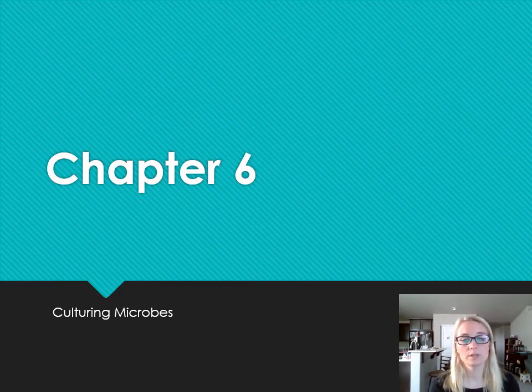And then you typically put it on some kind of media. The media is like your broth or your agar or whatever it is you're going to be growing the bacteria in or on. All right. So usually you'll grow bacteria in test tubes, which are going to contain a broth or a liquid medium, or in a petri dish, which is a solid agar surface that you grow bacteria on the surface. Sometimes you'll see agar in test tubes, either in a slanted version or a deep version that you might stab, like we saw with the oxygen requirements medium.